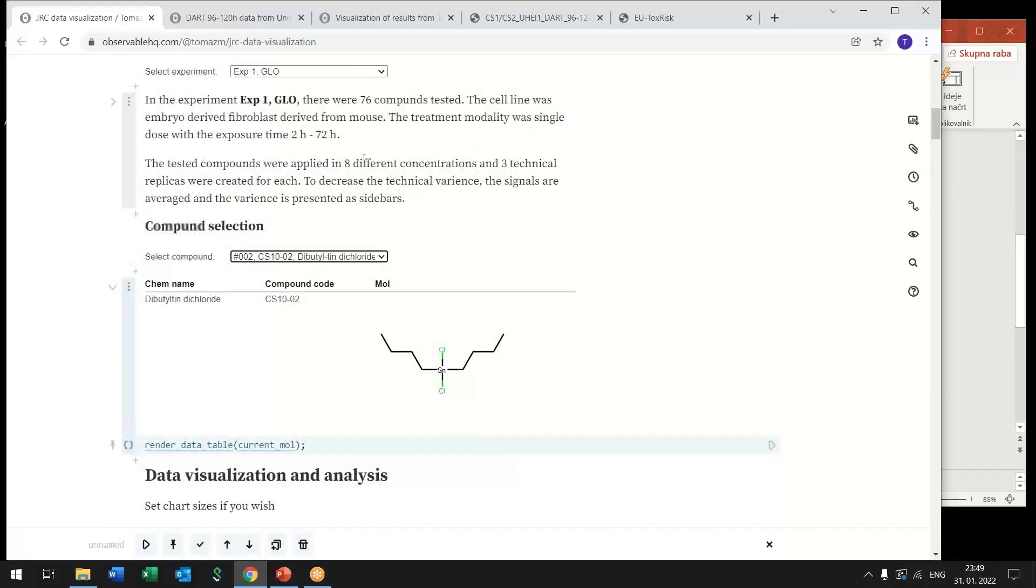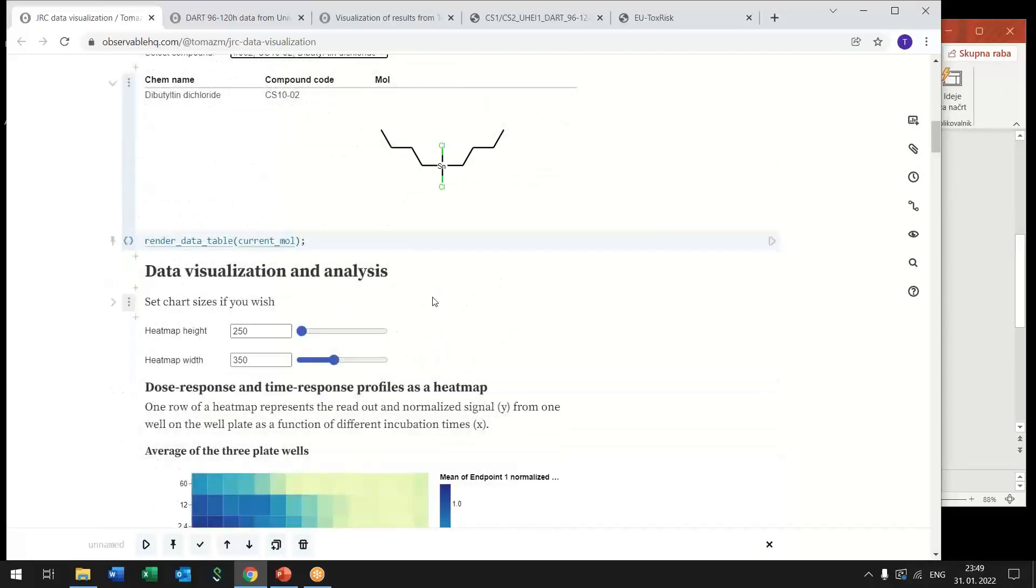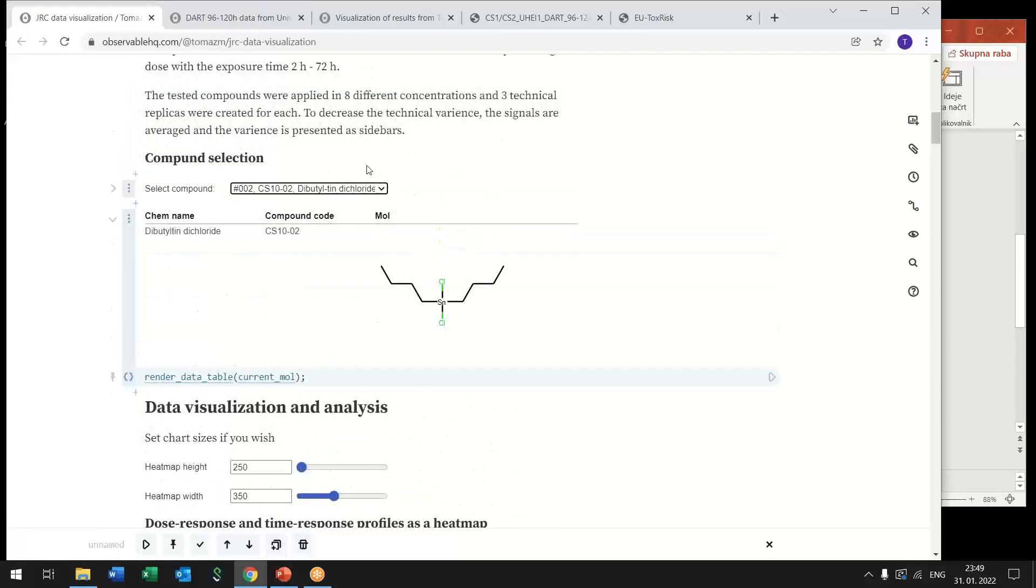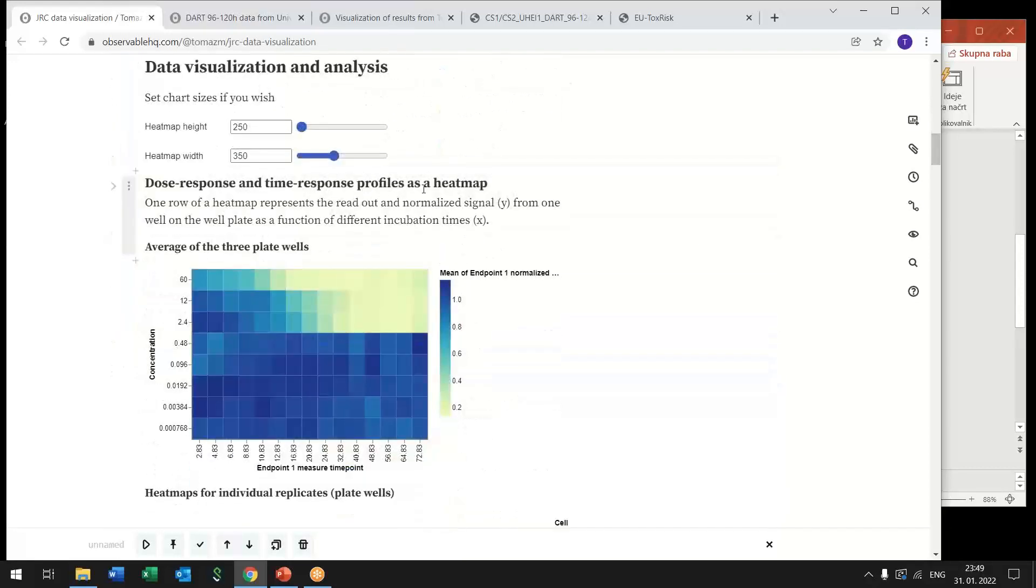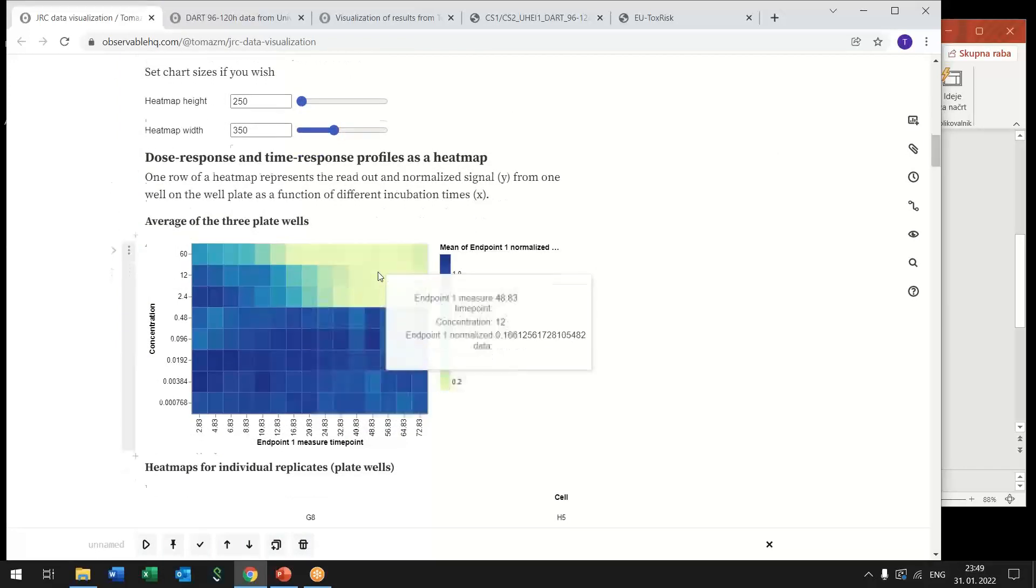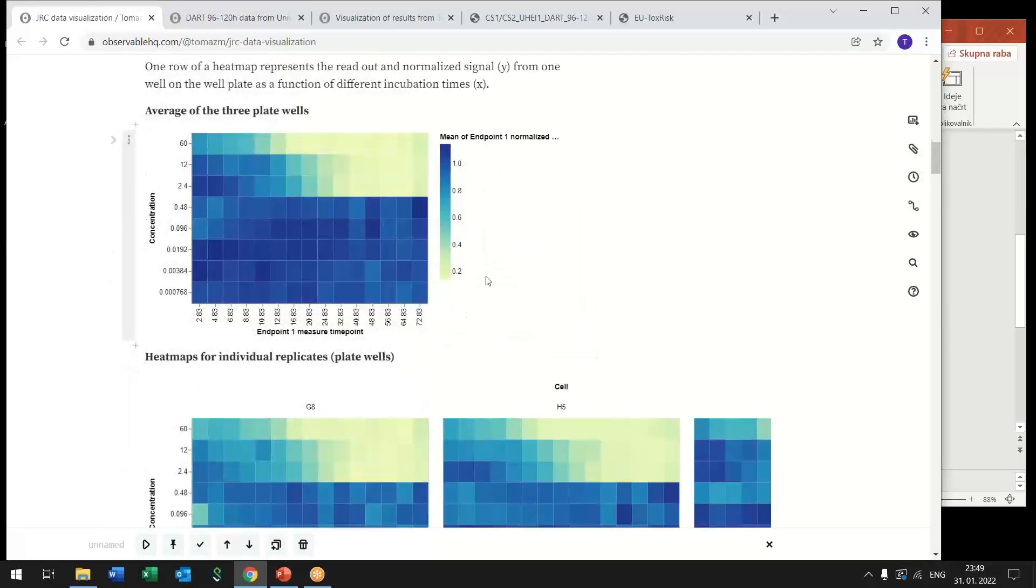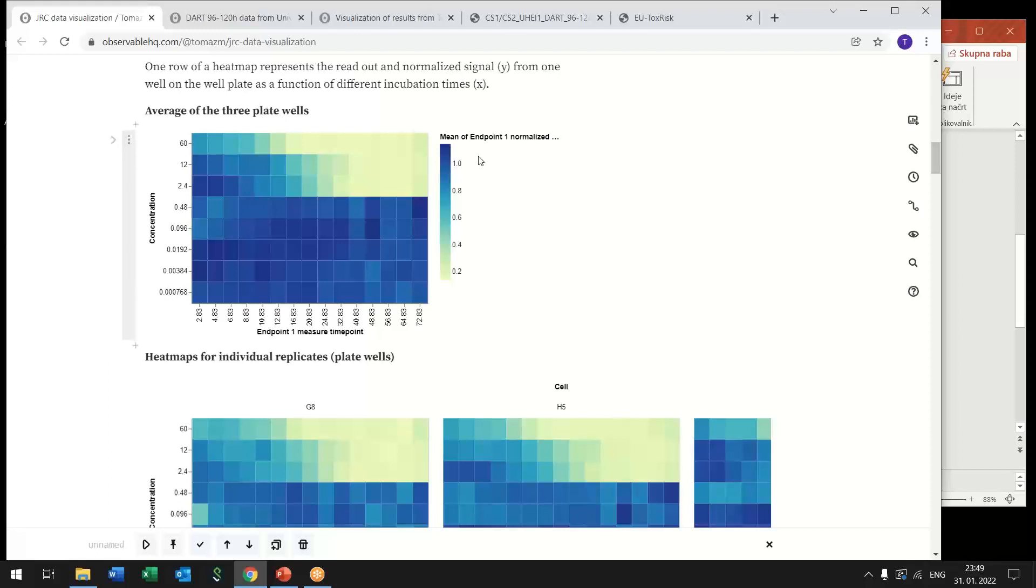So based on these selections we can access only a portion of data coming from this experiment and from this compound and we get measurements for that conditions. In this case, each compound was tested at different concentrations and for different time exposures and then cell viability was measured.